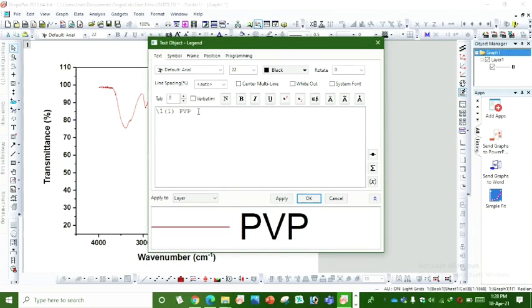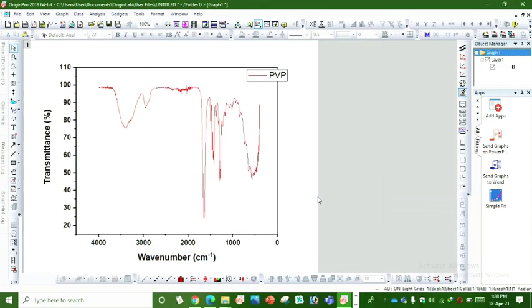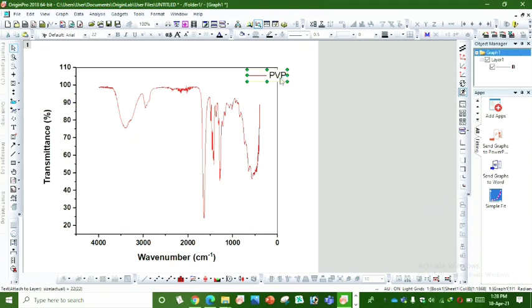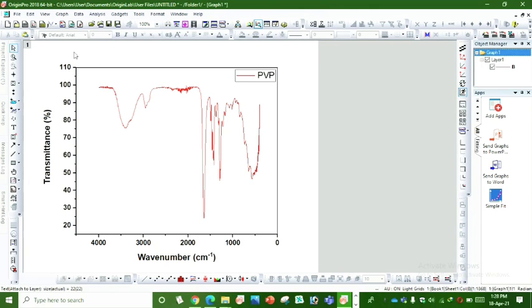So this is how we can plot FTIR graph by using txt file.